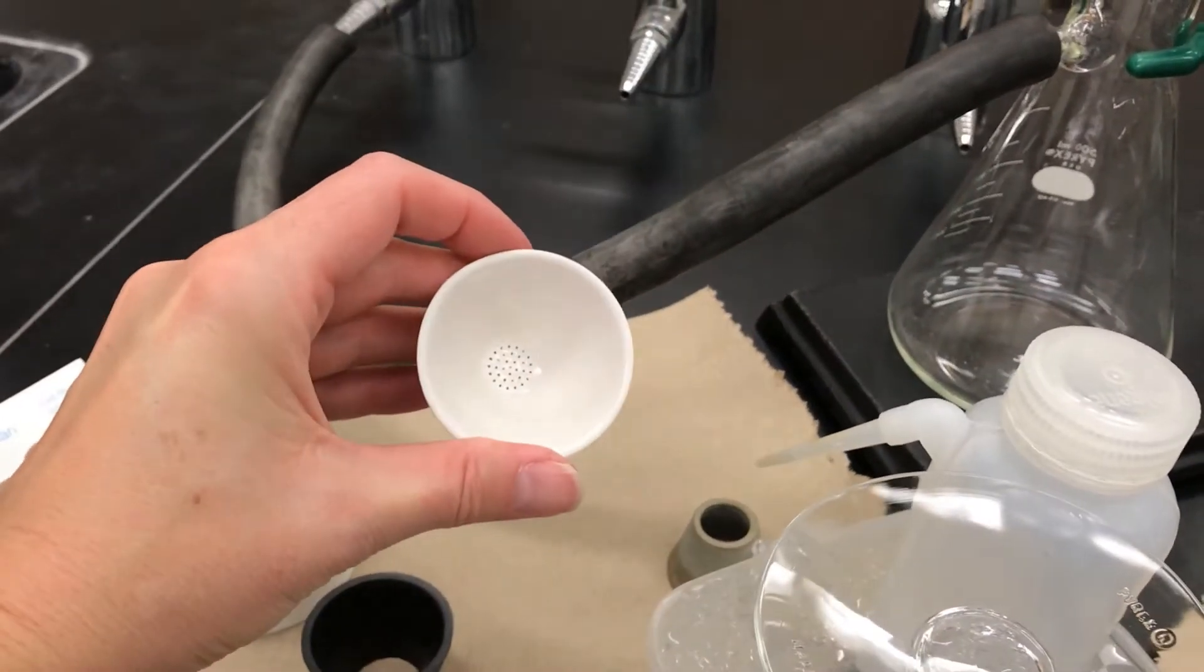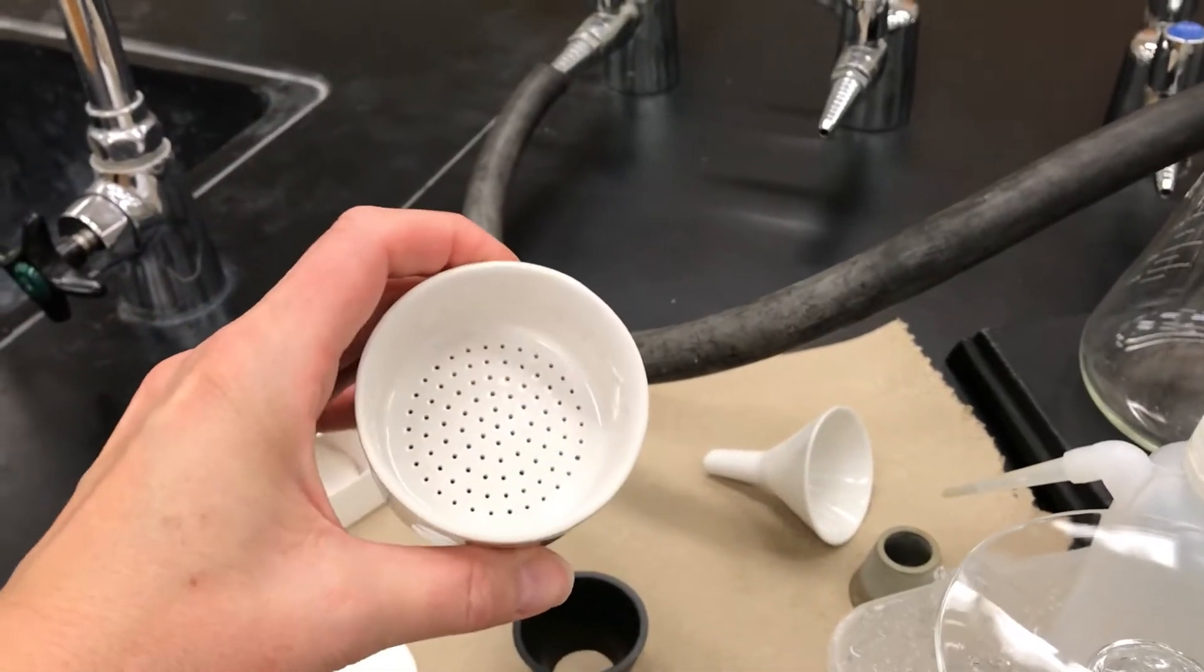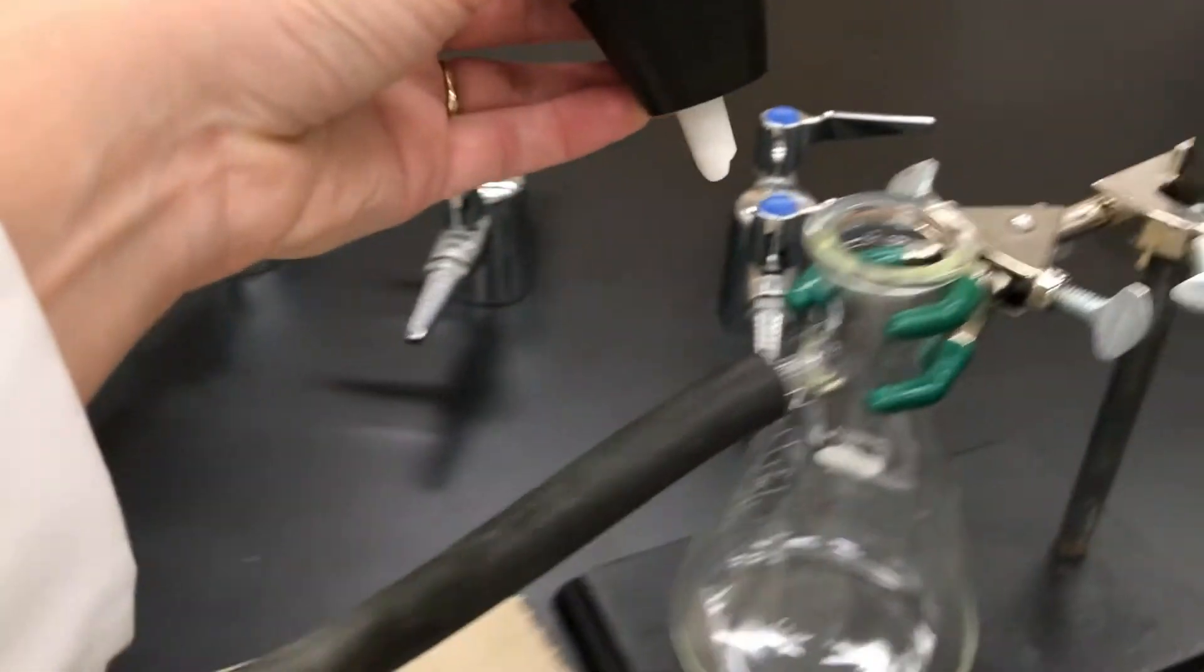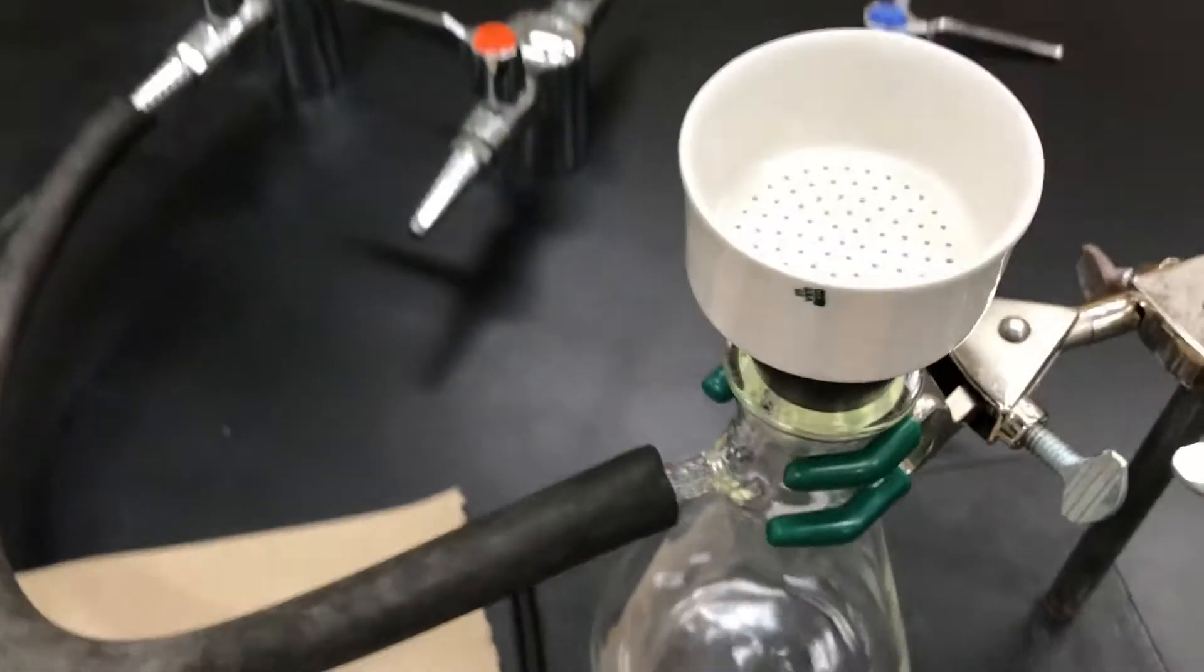And we need to put a funnel inside. There are different kinds. That first one was for small scale, but we have a large scale here. So I'm going to use this one, which is called a Buechner funnel. You use a little rubber adapter to connect the funnel to the flask and that'll create a good seal.